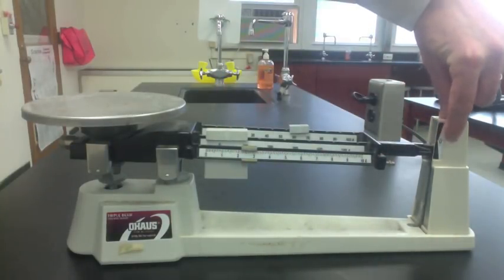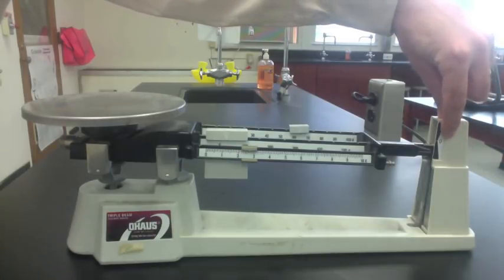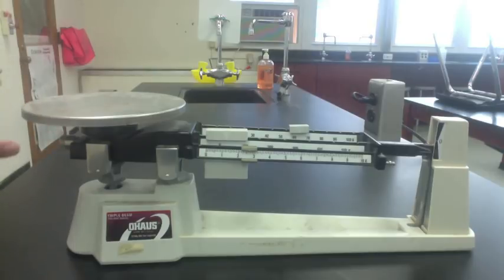You have your pointer — that's how you know that it's in balance. And finally, you have the adjustment knob on the side. That's for zeroing out the scale.